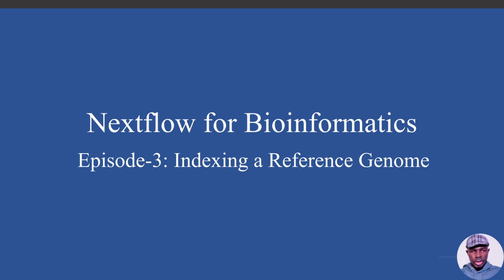In today's video, I'm going to show you how to index a reference genome. Alright, so what we are going to do is write a Nextflow script that will index a reference genome for us. If you are going to perform genome mapping or variant calling, one of the things that you will do is to index your reference genome. So I'll show you how to write a Nextflow script to do this.